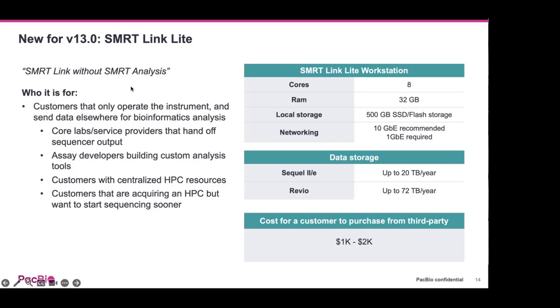One is folks that already have their own compute HPC infrastructure, but it's not using our PacBio provided secondary analysis pipelines. So these are like the Broads of the world. They probably already have their own HPCs, so they don't need a special one just for running PacBio stuff. And so all they need for SmartLink Lite is just a separate computer that is not an HPC.